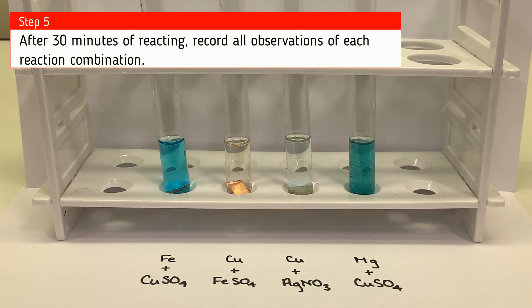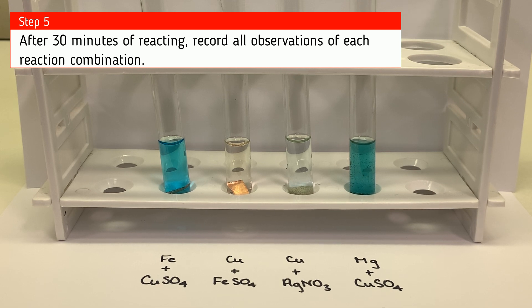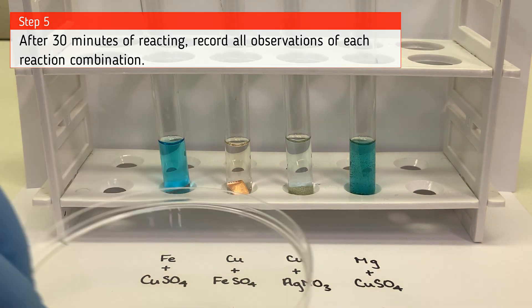Okay, these reactions have been sitting here for 30 minutes, so what I'm going to do now is dump each one out so you have a chance to see what all the products look like, and I'll try to hold them up to the camera so you can make your final observations after 30 minutes.